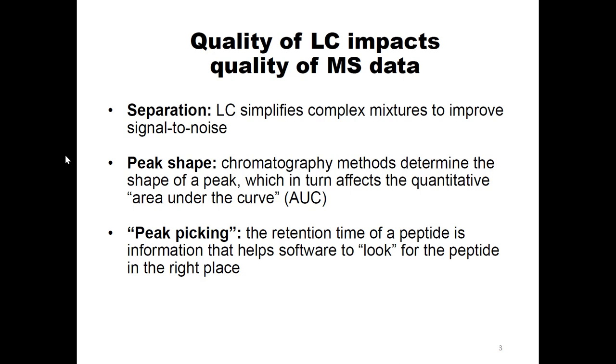And then finally, knowing something about a peptide's retention time helps us tell Skyline where to look for the peak. So if you have like an hour-long gradient and Skyline's saying, wow, you really want me to pour through an hour's worth of liquid chromatography to pick out your peak, you can help it a lot by saying, how about you just look in this five-minute window right here? So three big reasons we should, as mass spectrometrists, be caring about the instrument in front of our instrument.